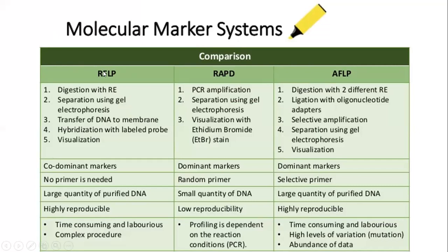We looked at two markers, RFLP and AFLP. These two are common, having the FLP. The alphabets are common, only R and A are different here. Basically, the name itself explains the technique or methodology you are using. You are cutting the given genome at restriction enzyme sites, based on the restriction enzymes and their recognition, binding and cutting pattern.